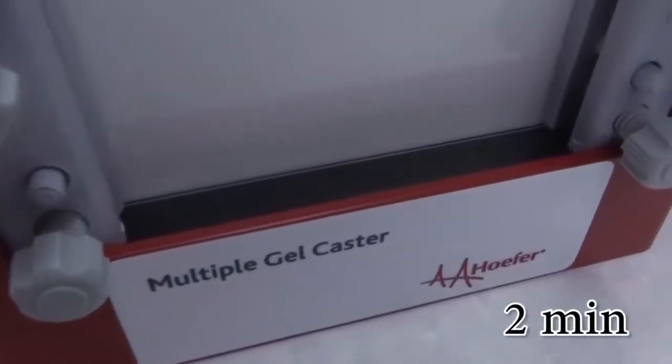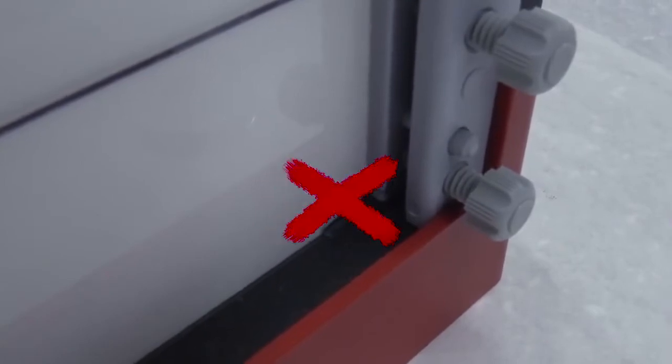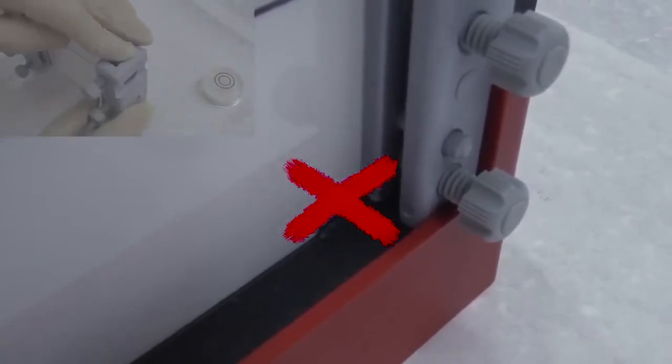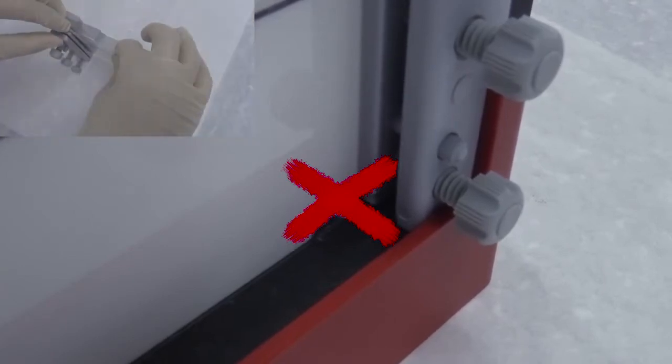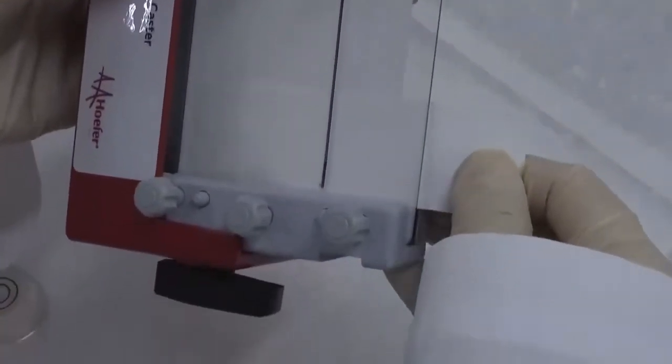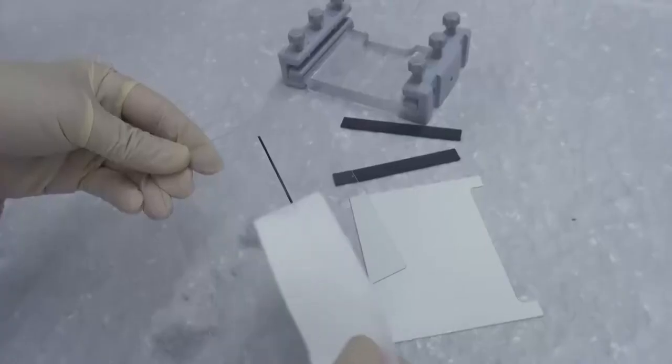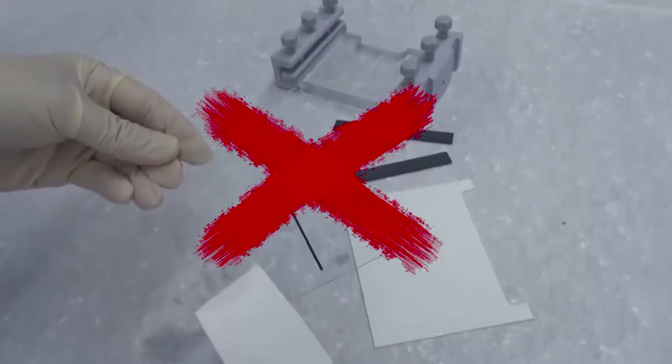Fill the space in the cassette with distilled water and let it stand for two minutes. Observe if any water leaking at the bottom. A leakage means the cassette has not been assembled properly or the bottom of it is not flush. Then the cassette has to be reassembled. If there is no leakage, pour the distilled water out. Insert a filter paper strip between the plates to blot away the residue water. Do not disassemble the cassette for drying. Otherwise, you waste all your work so far.